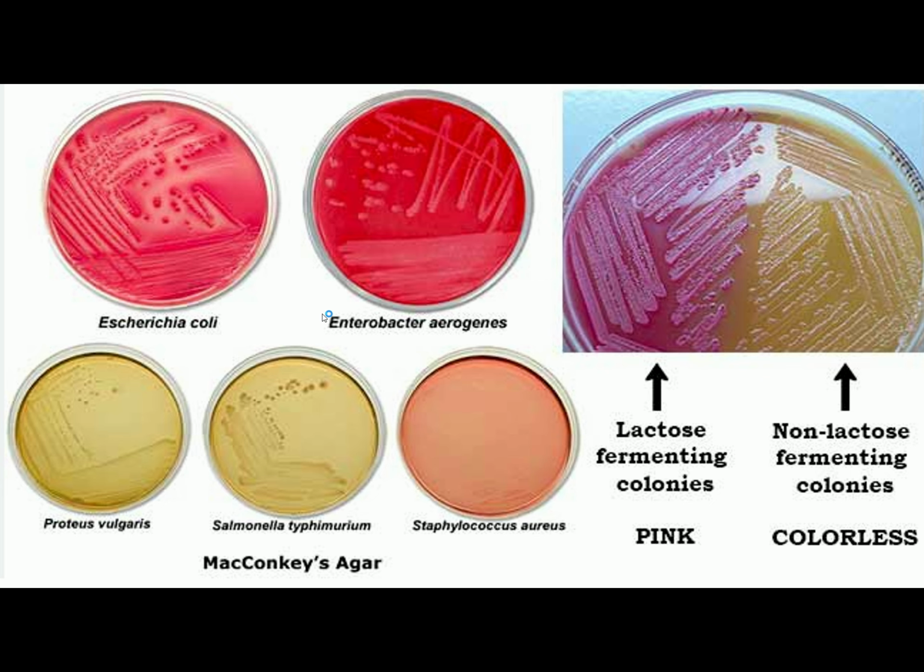So this is the appearance of your MAC. So again, kapag lactose fermenting yung nag-grow dyan, it will produce pink colonies. Pero kapag non-lactose, usually colorless.